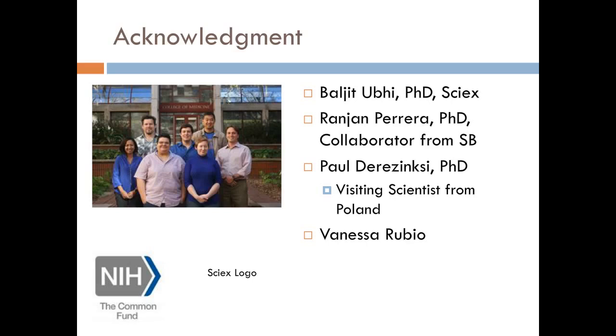What acquisition mode did you collect this data in, data-dependent or data-independent? This was collected in a data-independent mode so that we could look at things that we don't yet know are there and gather as much information as possible.